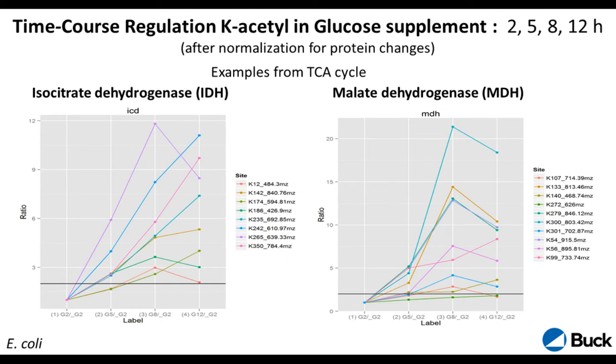One thing that we find very interesting is that there's a very dynamic behavior of acetylation, or PTMs in general. On the left and on the right, you can see that if you take one protein, on the left isocitrate dehydrogenase, and monitor different acetylation sites, indicated by different color curves, with a time course on the x-axis, you can see very different dynamic responses of PTMs even within one protein.